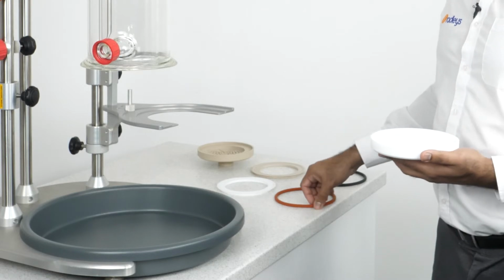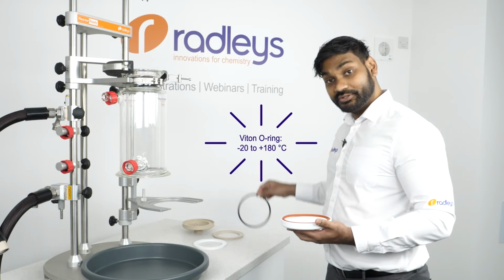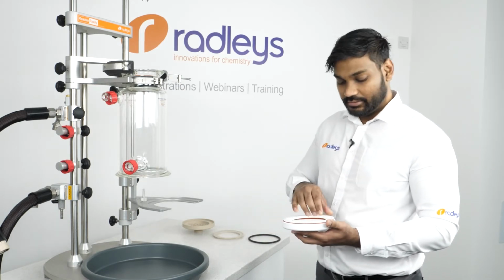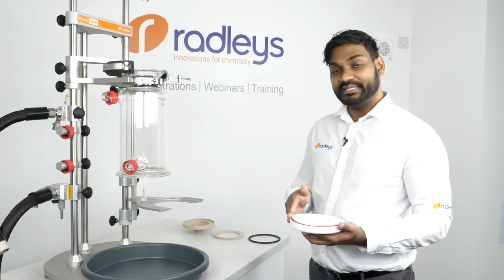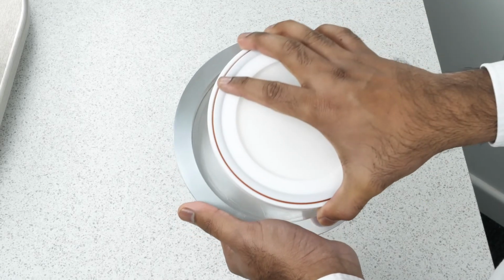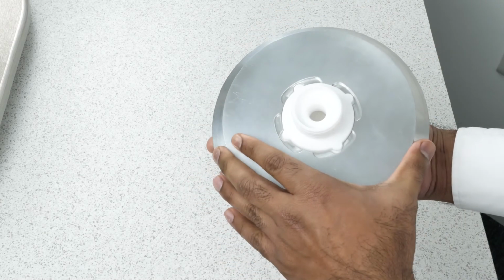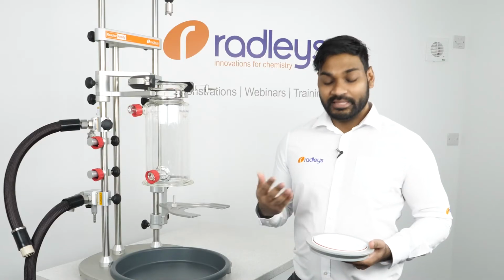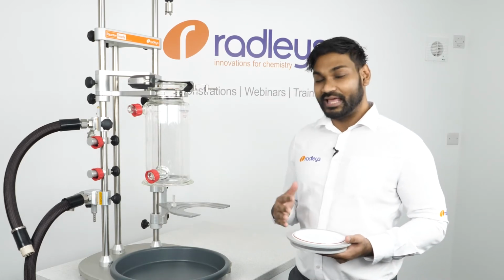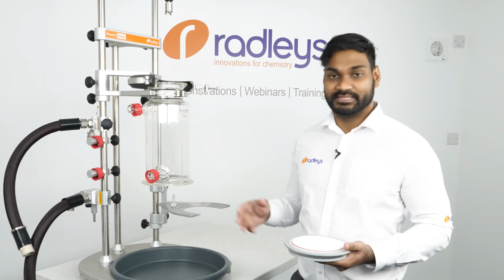Next goes the filter plate O-ring, which can be made out of silicone or Viton. And then goes the filter plate gasket, which is also made out of PTFE or PEEK, just like the bases. The filter base then locks into this aluminium filter cup with a bayonet fitting. The aluminium filter cup ensures that when we clamp the base onto the vessel, the risk of damaging the base is reduced, and also the risk of leaking from the base is minimised.